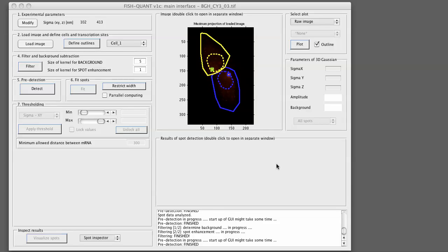Hi, this is Florian. This is one of two videos to explain how to set up the mature mRNA counting in FishQuant. We implemented this as a two-step process where you first perform a pre-detection on a filtered image, and then in the second step those pre-detected spots will be fit with a 3D Gaussian in the raw image.